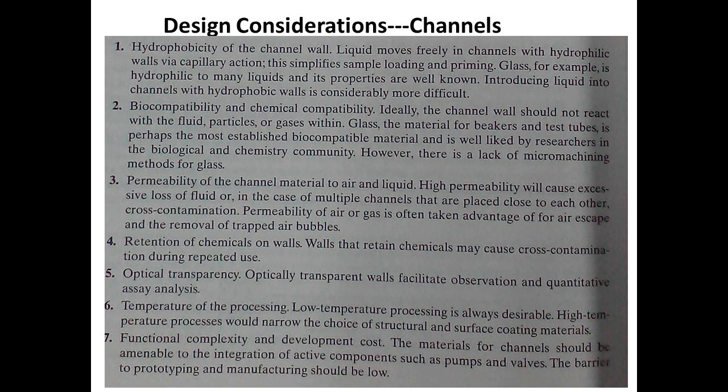The second point is the biocompatibility and also chemical compatibility. This point refers to whether the channel wall will react with the fluid or not. So you need to find a biocompatible or chemically compatible material. In this lecture, glass is usually used, because most of the researchers in this field feel that it is a biocompatible material.